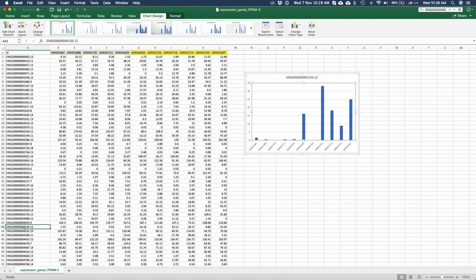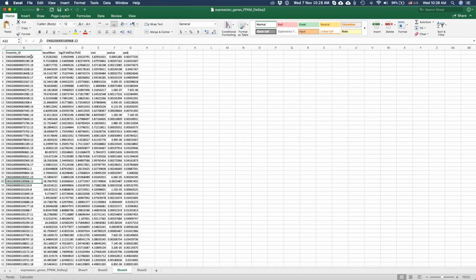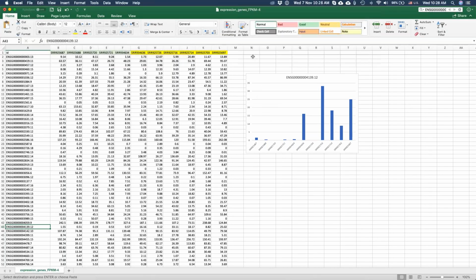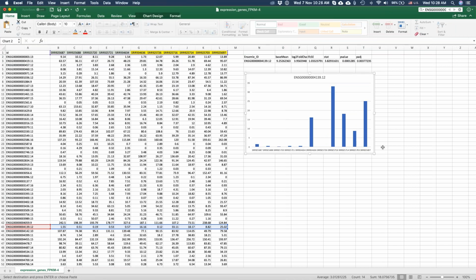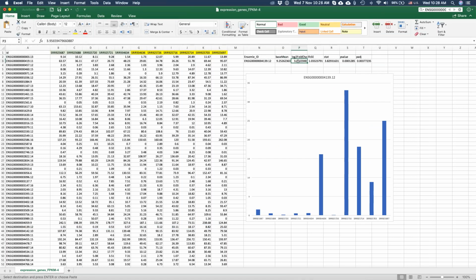Now for this gene, 4139, if we go back to 4139, that was the first one, what are we seeing here? Let's take a look over here and copy this and go back and place it in here. What does this mean in the context of the actual expression? Okay, so what we see is the log two-fold change is about 4, very good. P-adjusted value 0.003, so statistically significant.